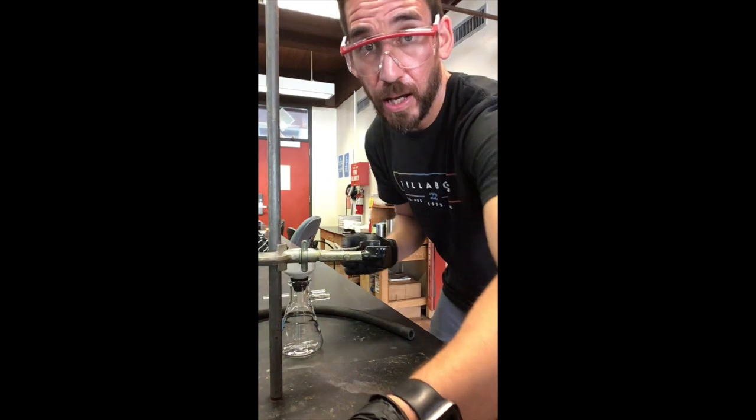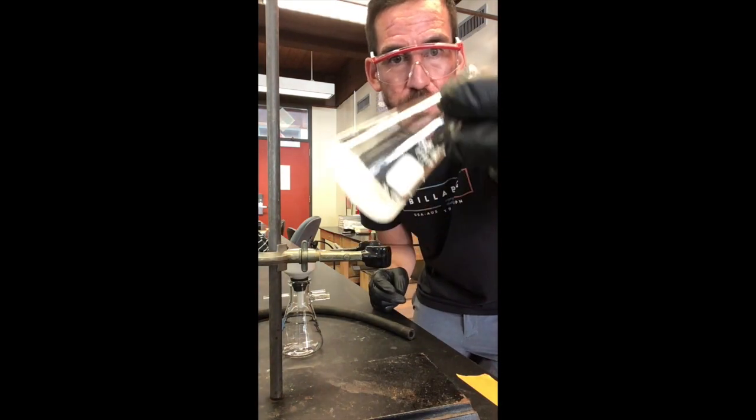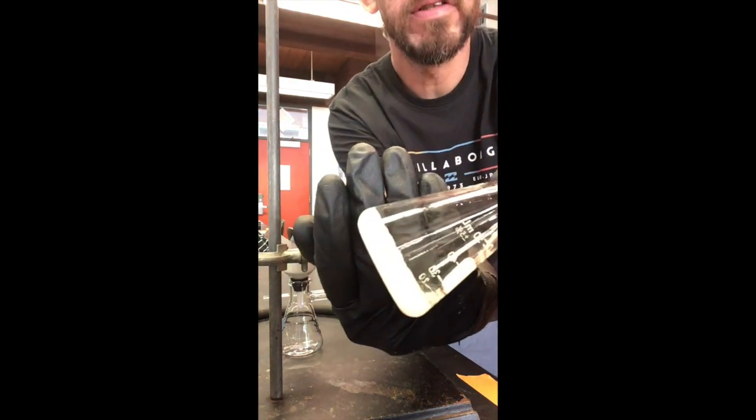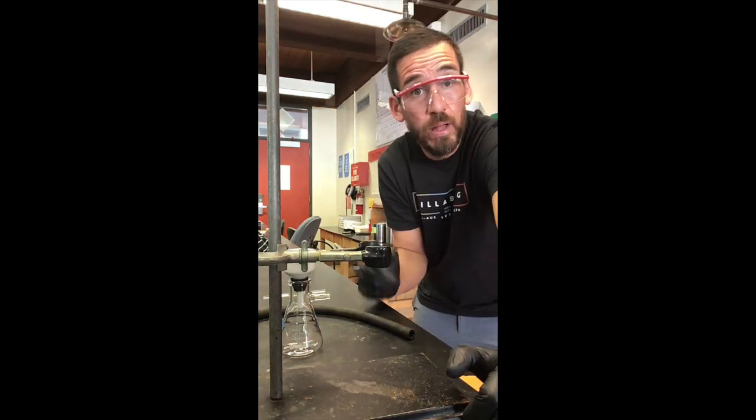Okay, so now I've let this sit for quite some time, and you can tell there's a lot of solid in there. Actually, mostly solid, not very much liquid is obvious, so that's cool.